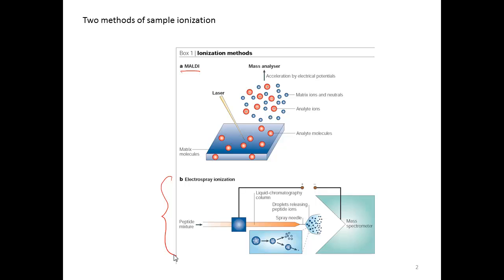Before we describe either of these two methods in greater detail, first I want to point out what a challenging problem this is. Think about a solution of salt water, and if you let all the water evaporate, eventually all the salt molecules are there at the bottom of the glass. Charged species generally don't like to evaporate into the gas phase.